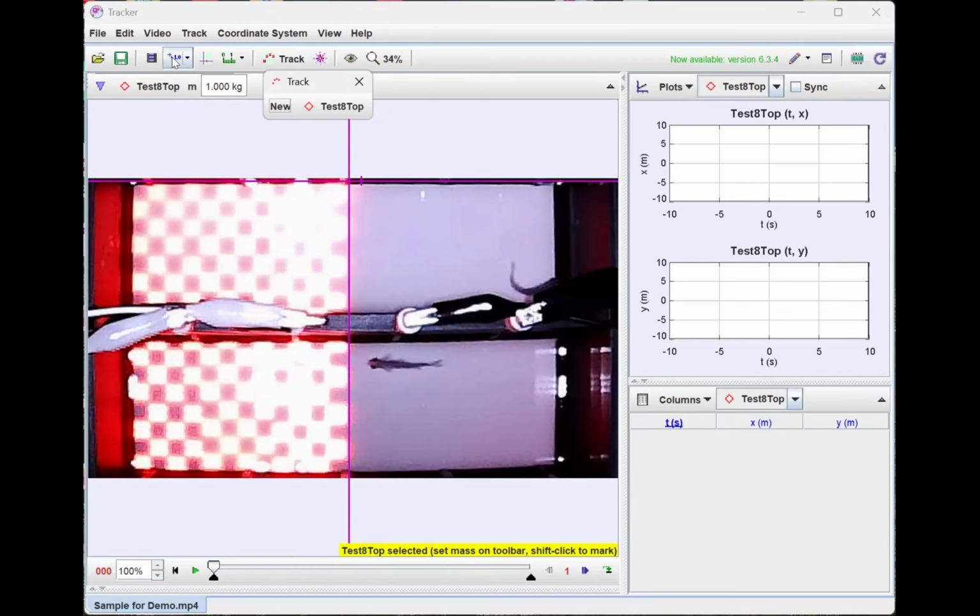And then we need to click on this calibration stick. We need to put the stick from, this stick will measure what's the real distance in our real world. So if we are measuring the half length of the arena, it will be 9.6 centimeter, and then we convert it into meter. So the real distance will be 0.096.